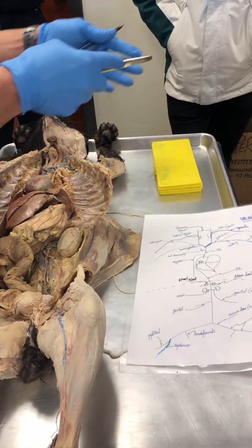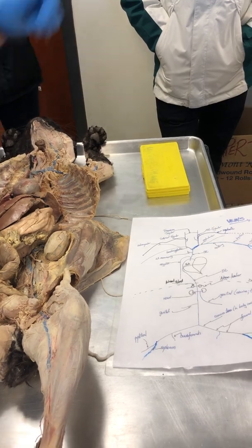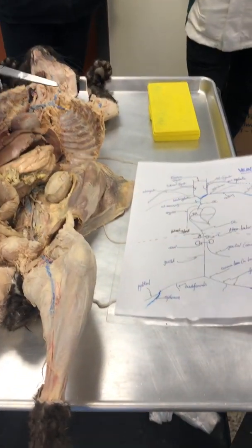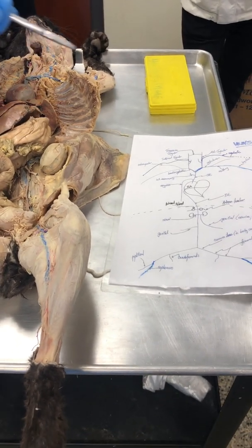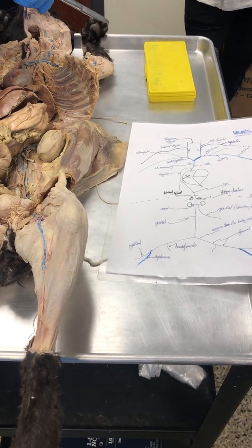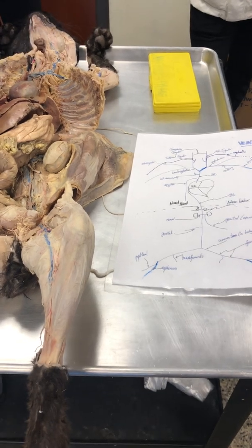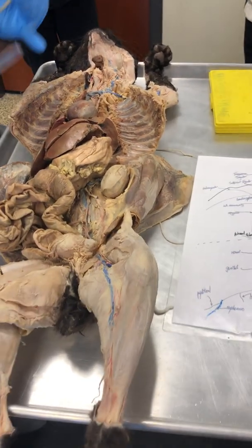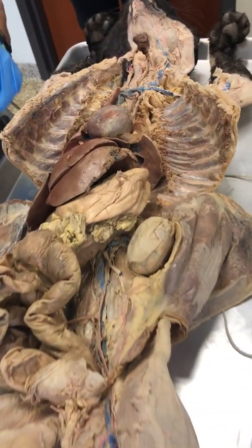Parietal pericardium is analogous to dura mater of the sheep brain. So it's just kind of that linkage. If you didn't get it right today, that's the linkage you do. There's no funny stuff now, people. I'm going to ask the dura mater, I'm going to ask parietal pericardium on the exam next week.